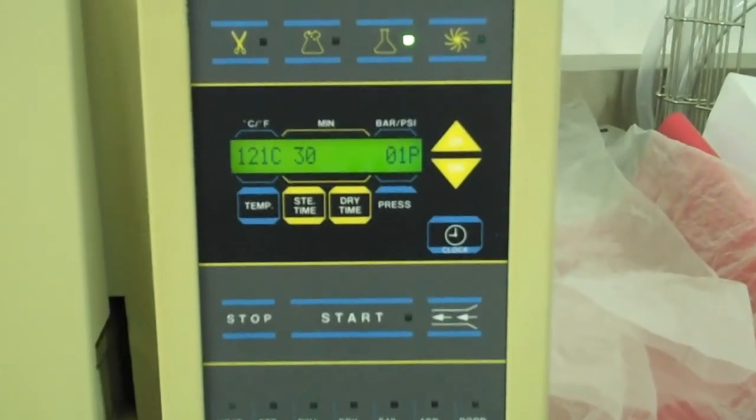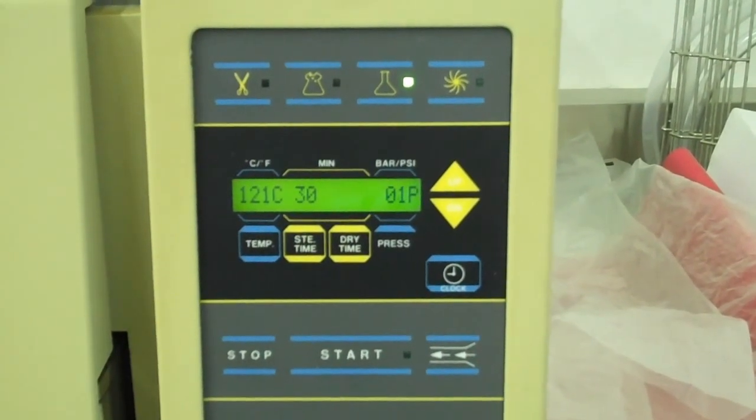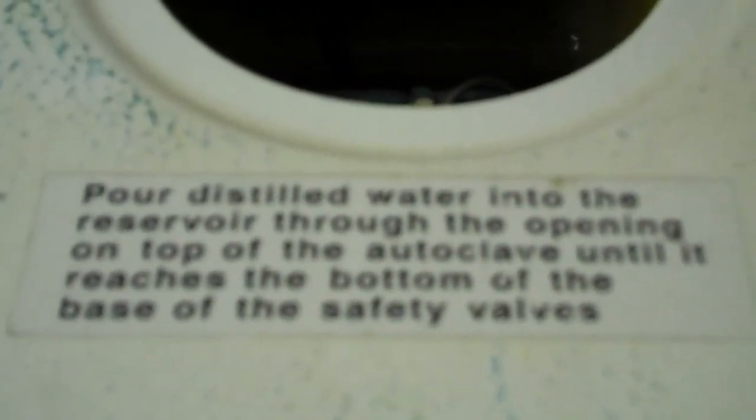An autoclave is a pressure cooker with high temperatures, controlled by this microprocessor on the top. There's an opening to the tank. This tank holds distilled water and also has the outlets. As you can see, there's some pipes that do the pressure release of the pressure cooker.